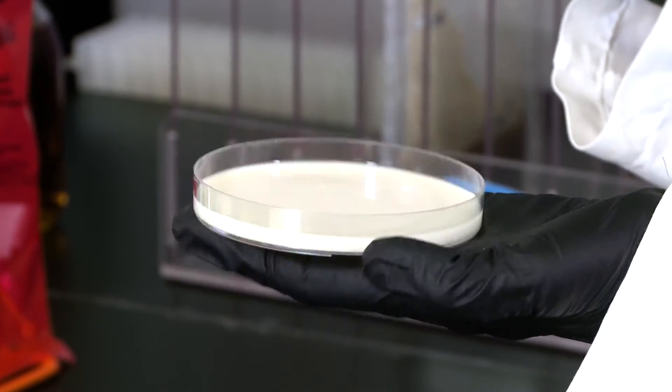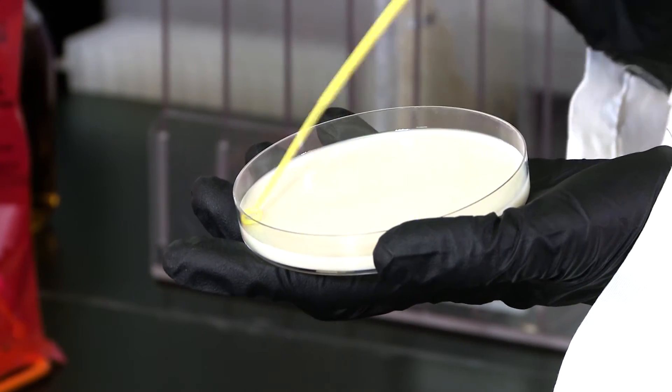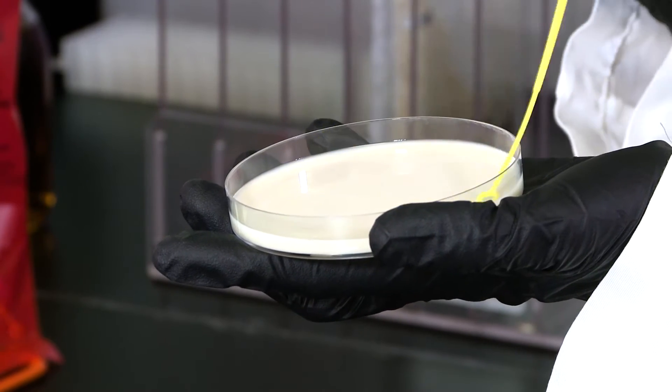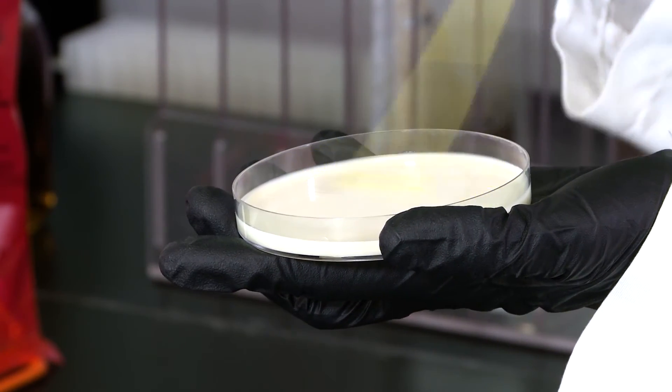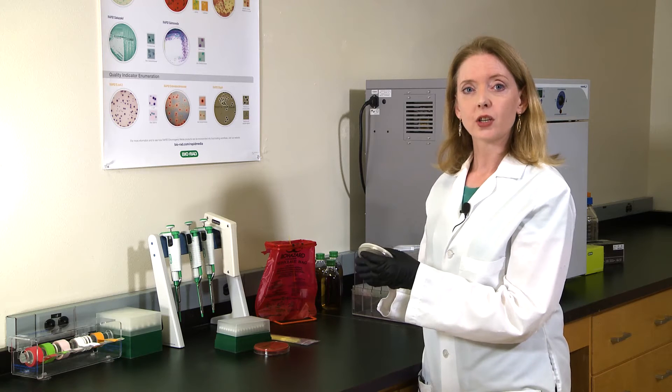Turn the plate one quarter turn and streak across the other half of the agar surface in relatively tight streaks over the whole dish starting from the edge of the previous spread. It is important to obtain well isolated colonies for further confirmation.